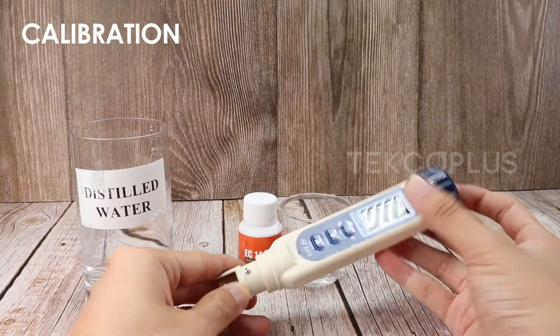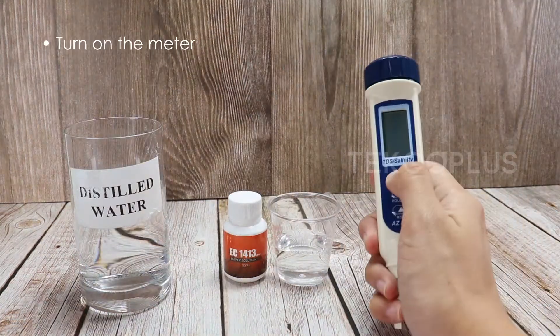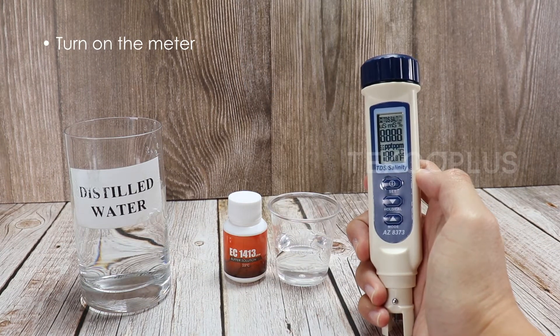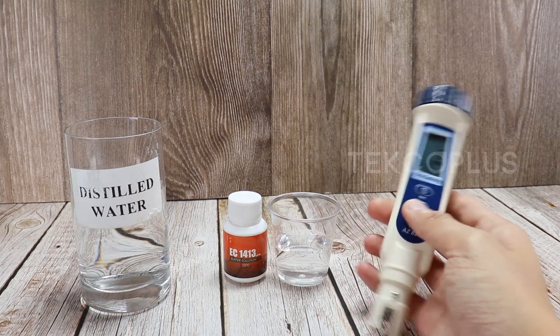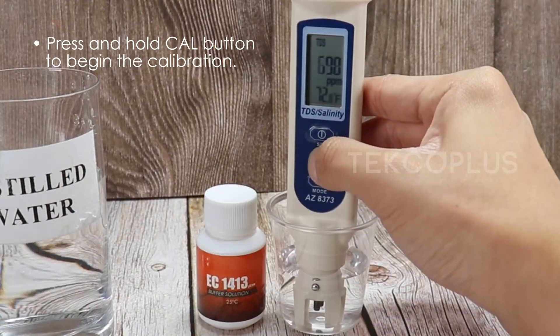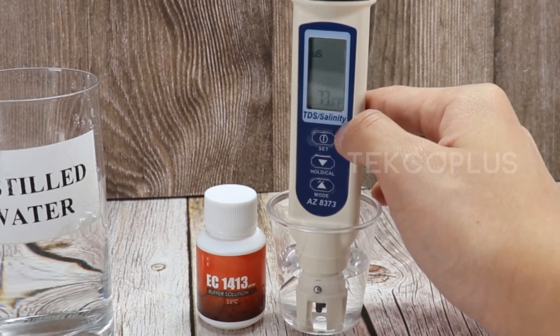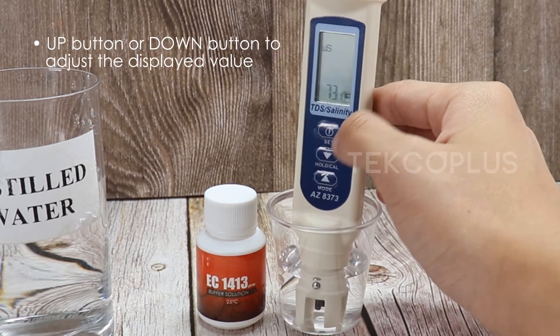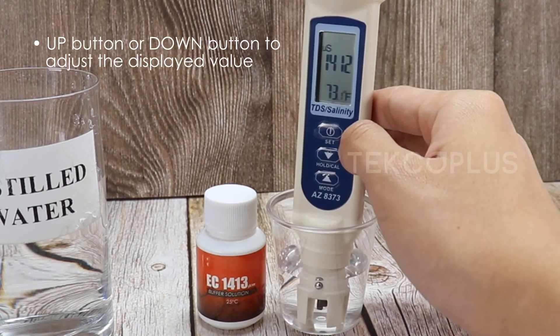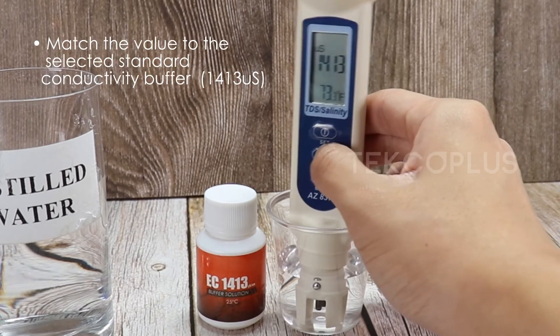To calibrate, soak the probe in distilled water for 15 to 30 minutes before calibrating. Turn on the meter. Dip the probe in the 1413 µS buffer solution and wait until the value becomes stable. Press and hold the cal button to begin the calibration.